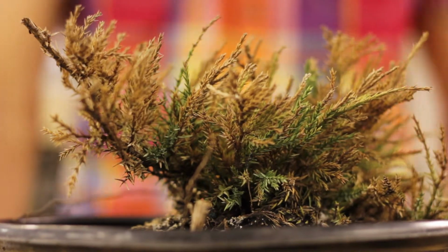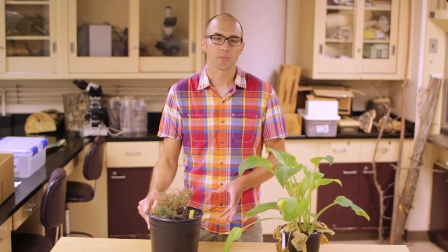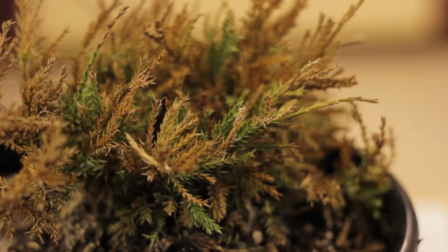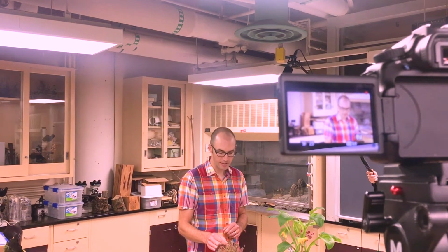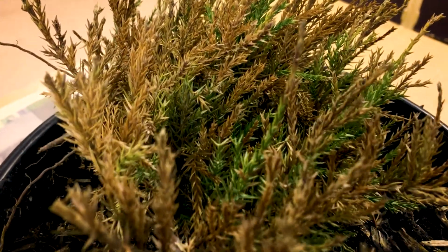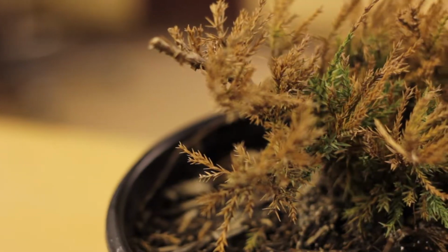It can actually be very difficult to diagnose a sample that is completely dead, because at that point other microorganisms have begun to colonize those dead tissues, and it can be difficult to actually find the microorganism that caused the disease in the first place. So what we're really looking for in a lot of cases is that area between the green and the brown tissue, so that area between healthy and dead plant tissue. Those are areas where the pathogens are most active and where we can more reliably find them.